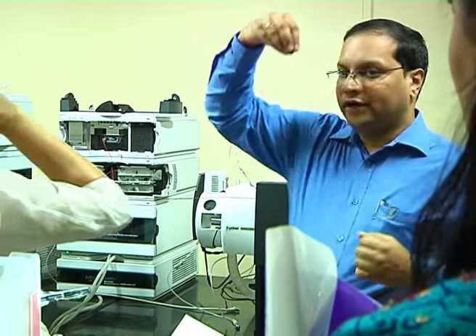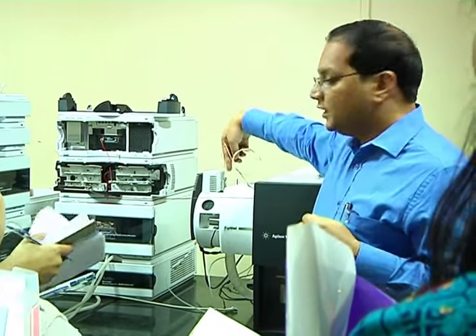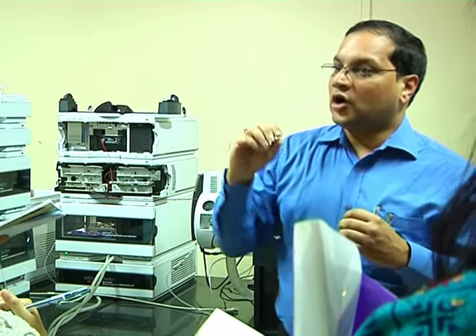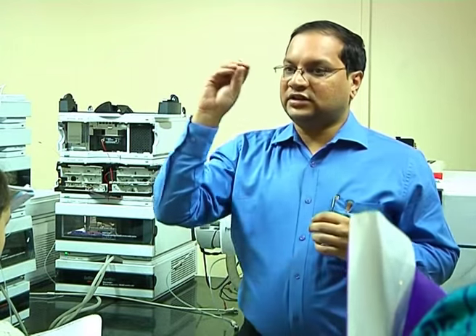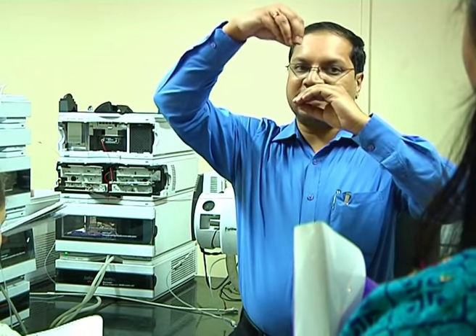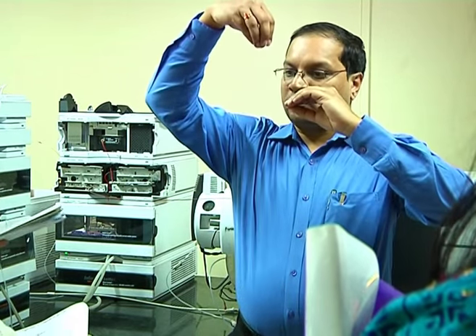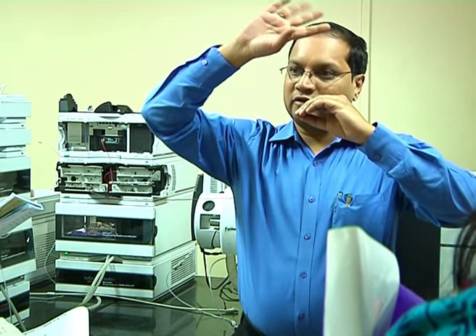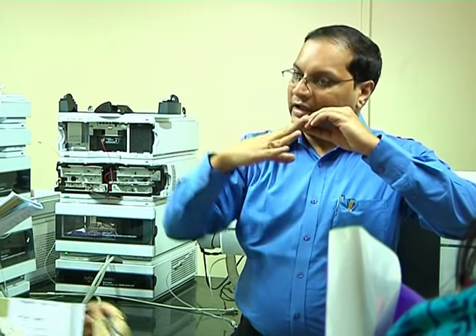Why so? It is called spray. The stream of liquid goes into the needle, and then it is sprayed. Why so? Because our analytes, we already know, are charged. So the charged particles or charged analytes are already there in the liquid. I want only those to get in, not the acetonitrile, formic acid and all those things. I want to get rid of that, and the ions should go in.